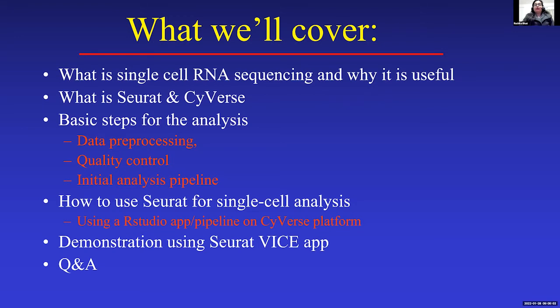And then I'll show you how to launch the app on CyVerse, followed by a demonstration using already set program commands and data that I have already uploaded in a public forum so that you can also try on your own, followed by question answers at the end of the webinar.